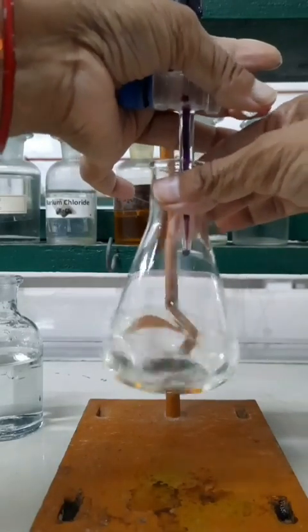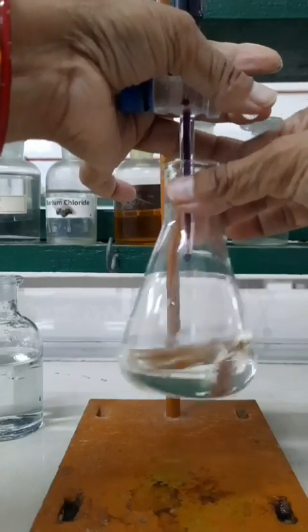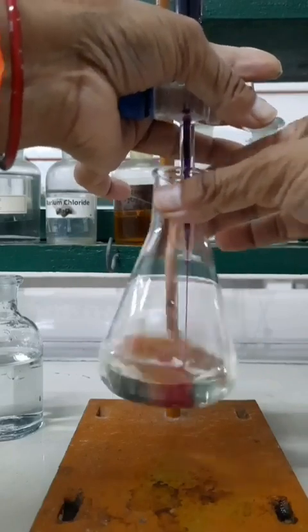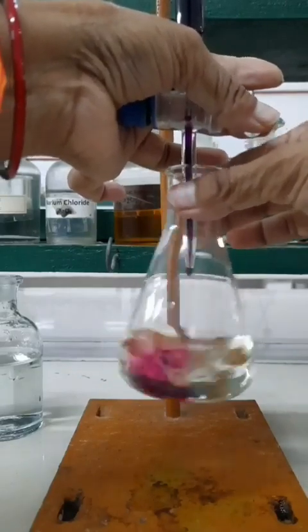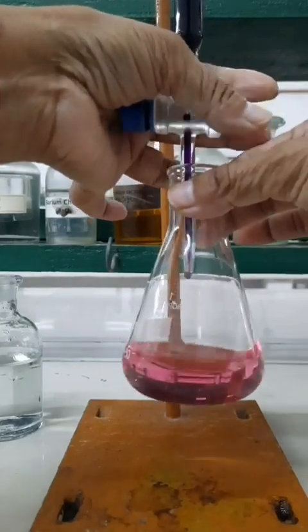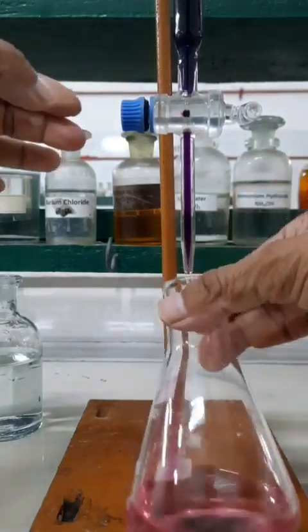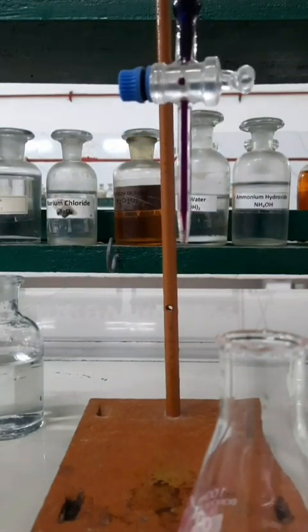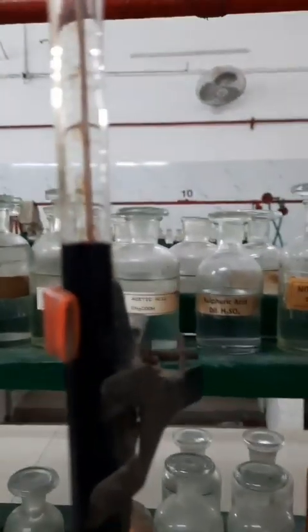So titrate it slowly by adding potassium permanganate solution with continuous stirring till the permanent pink color is obtained, and that will indicate the end point of the reaction. Now I am recording the first reading. You can see that we get the permanent pink color, and the endpoint has been achieved, and you have to note down the final burette reading. Here the final burette reading comes out to be 10 ml.